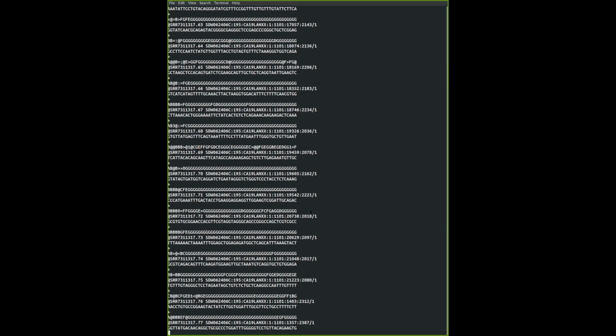Okay, so what basically that does is it searches for a certain string, and N basically asks if there's any non-call or miscalls in your sequence. But I guess there's a lot of miscalls, and also the name of the file contains an N, so probably it might take quite a while. But you can actually cancel this. You can go back to terminal if you press Ctrl-Z. So I'm going to throw Ctrl-Z and hopefully it's fine.